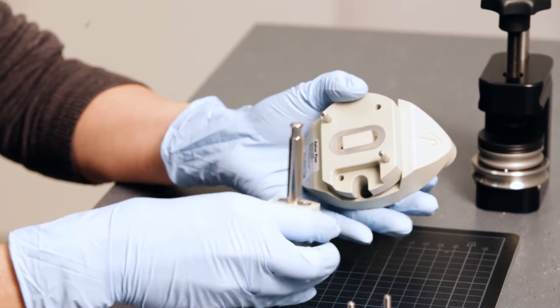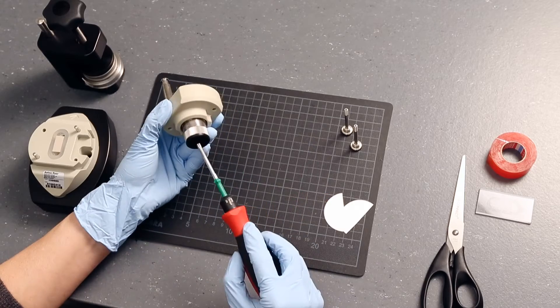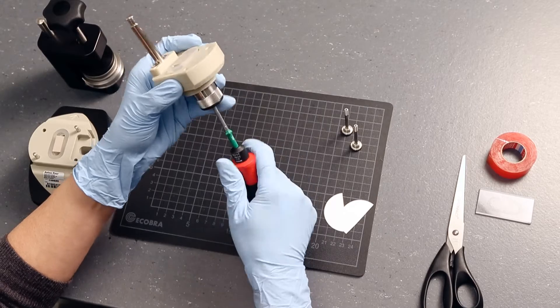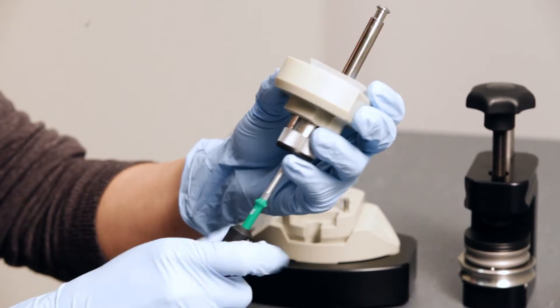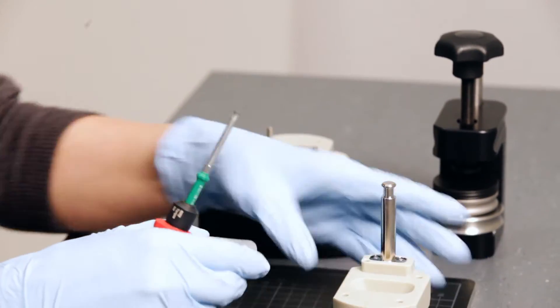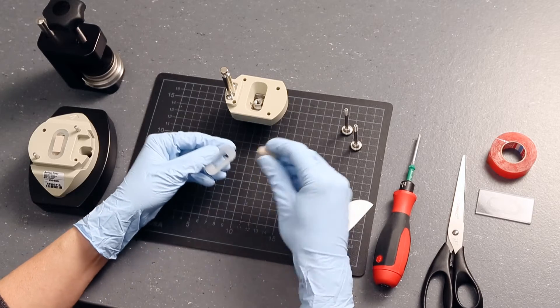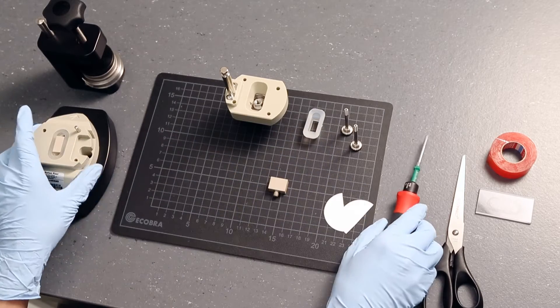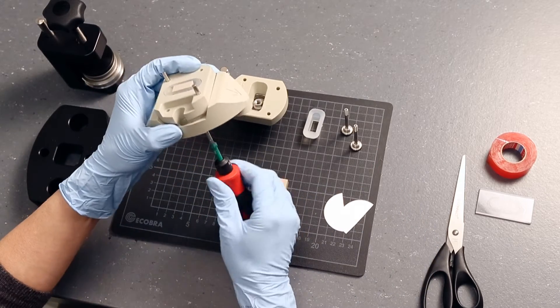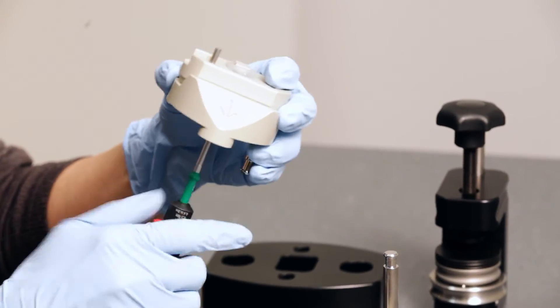Now remove the sample holders of both parts of the cell. Use the screwdriver to loosen the screw that fixes the sample holder by its thread. Remove the sample holder from the gasket. Repeat the same procedure with the second half of the cell. If necessary, dry the gasket and the recess of the cell.